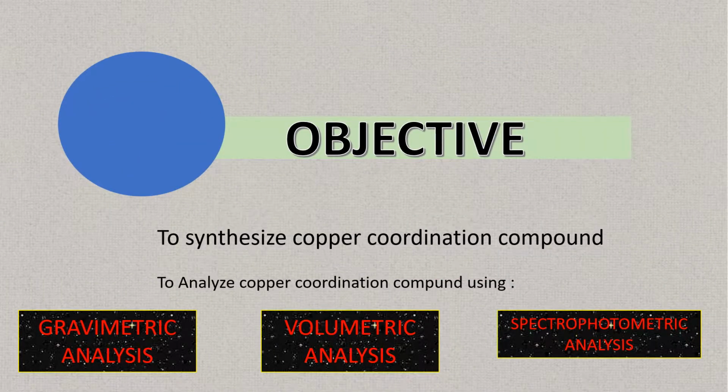The objective of this experiment is to synthesize copper coordination compound and to analyze copper coordination compound using gravimetric analysis, volumetric analysis, and spectrophotometric analysis.